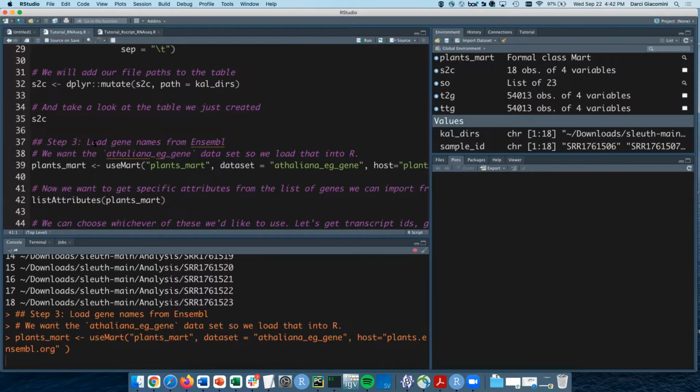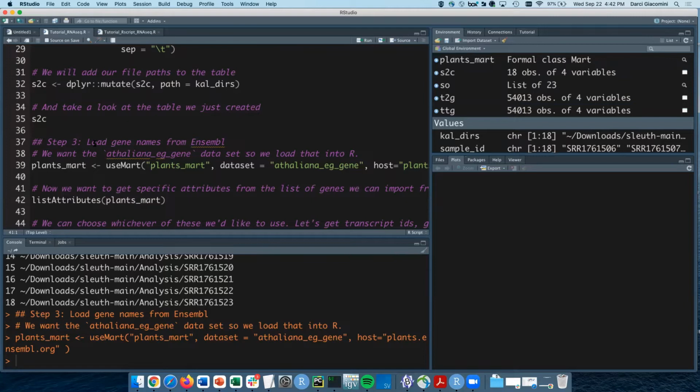Is everyone caught up to there, more or less? If you're able to follow along, if not, okay.